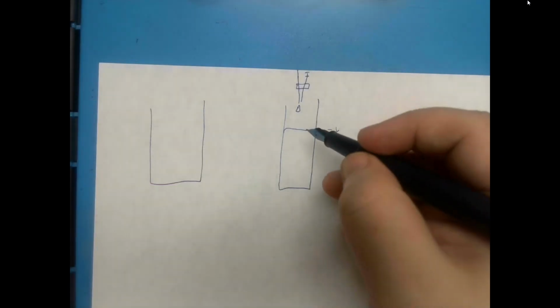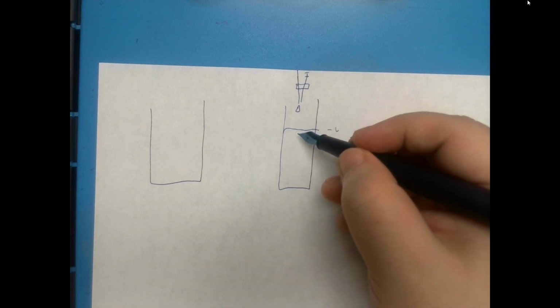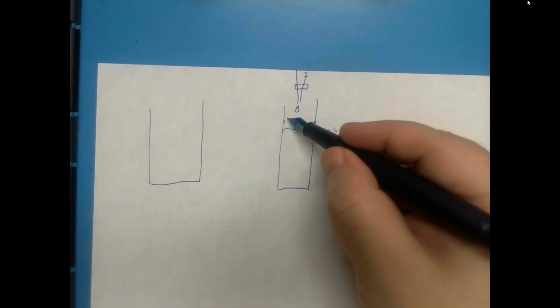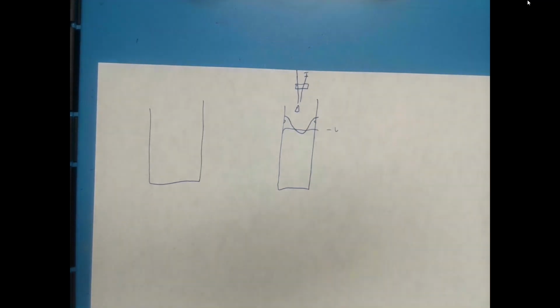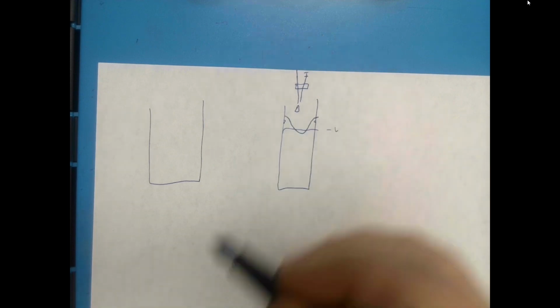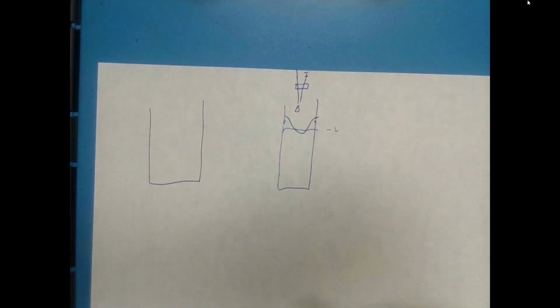Issues with this. What happens if you take a drop of water and put it into another thing? It might splash and you might end up with droplets over here. And what happens to the liquid as we swirl it? If some of this phenolphthalein gets right here, you have a tiny speck, and we're trying to add tiny specks when we get close to this point, and you swirl it, you might see your solution just immediately go through the pink phase, and you screwed up.